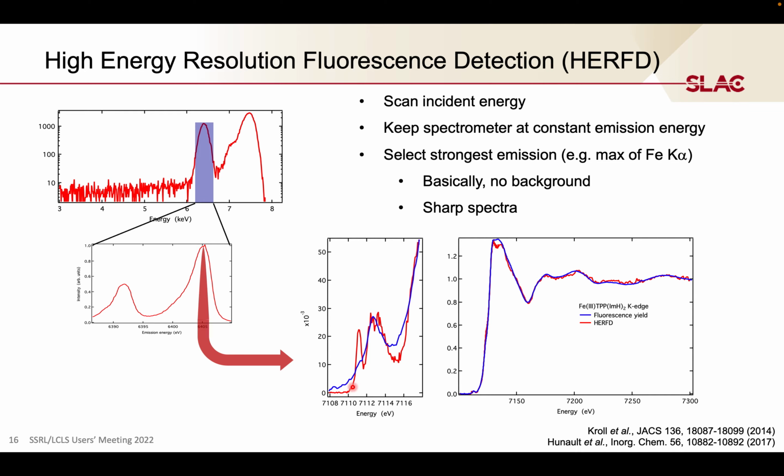And even that is not a good data. It's pretty noisy, because I did not spend any time on it. You clearly see huge differences. I mean, this peak before was a small shoulder, now it's a real peak. And also here in the shape resonance, you see a double peak structure instead of something broad. If you want to see better spectra, here are 2 examples where it has been done, but there are many other papers out too.